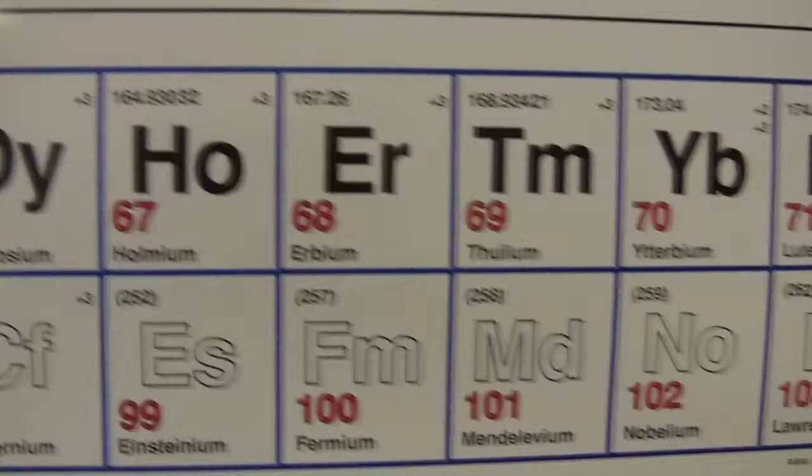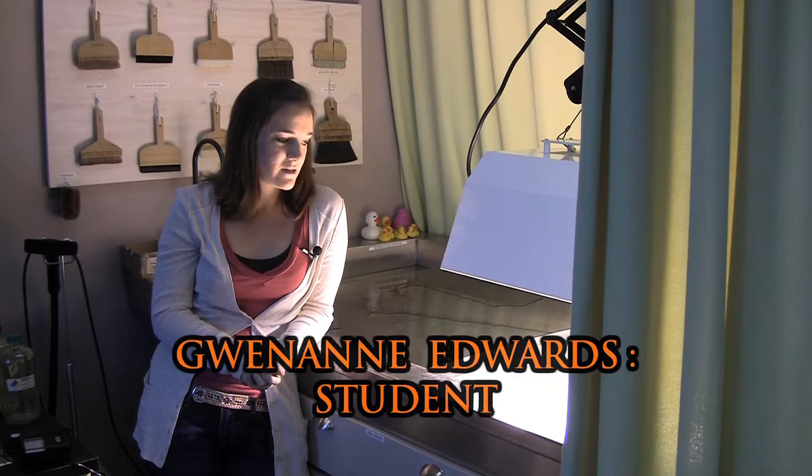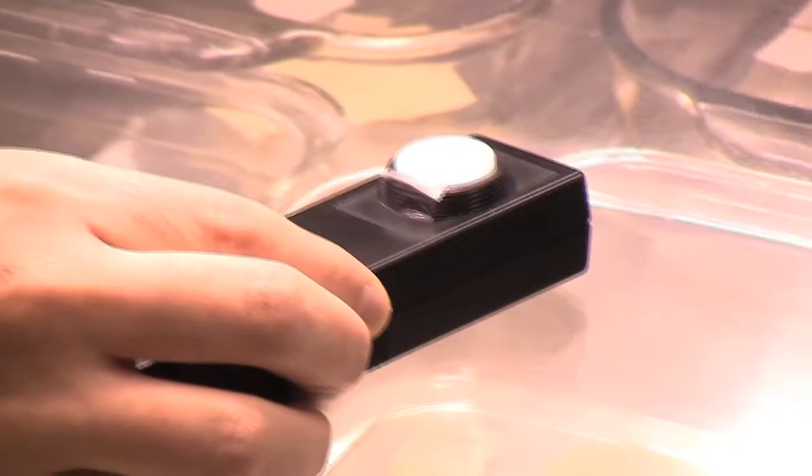I'm doing an experiment about light bleaching in ethanol, and conservators often light bleach aqueously, so in water, but I'm testing to see if it can be done equally as effective in ethanol so that we can light bleach materials or works of art on paper that have media that are water soluble or water sensitive.